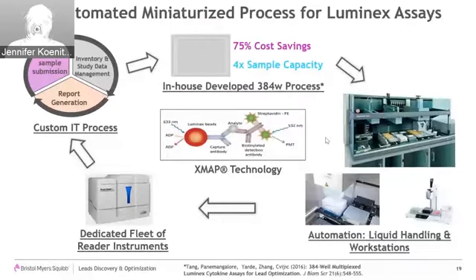We also make heavy use of a number of automation platforms, liquid handlers, and workstations, for example, to support the consolidation of samples from submitted sample plates into master assay plates, or the steps of sample washing, for example. We then have a dedicated fleet of reader instruments that, when we are not quarantined in our homes, run pretty much 24/7 to process these samples.